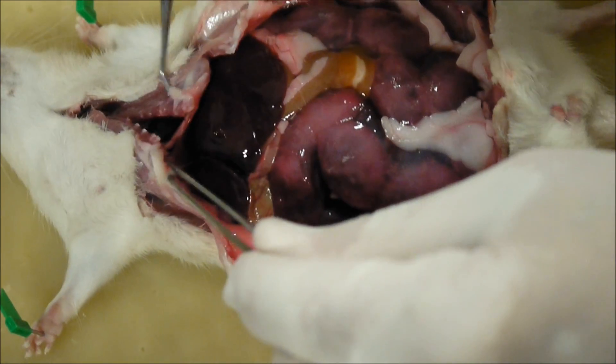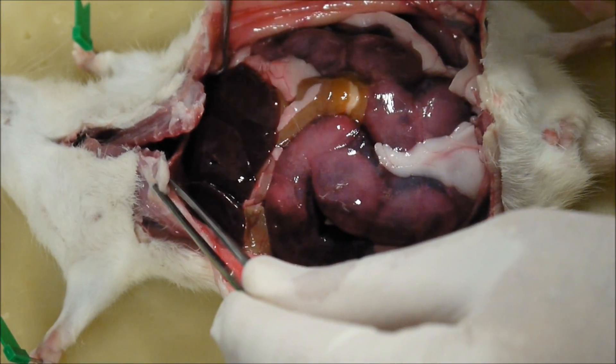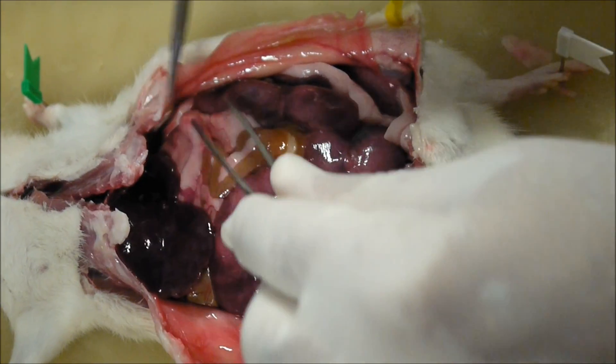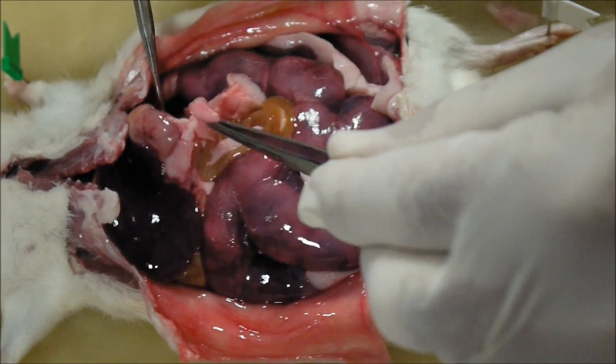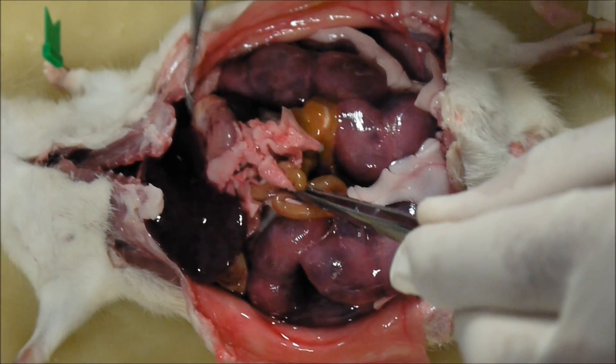Now let's start up here. This dark red organ here is the liver. We can just move that out of the way. And if you move the liver out of the way, you'll find — watch to the left of the liver — you'll find the stomach here. See the stomach? There it is there. That's the stomach.